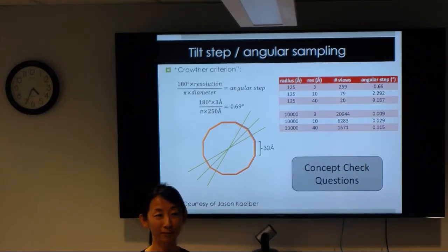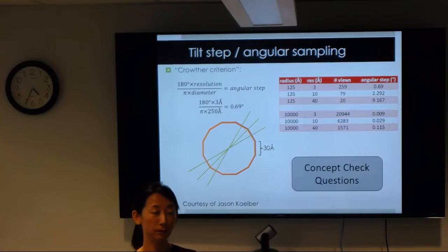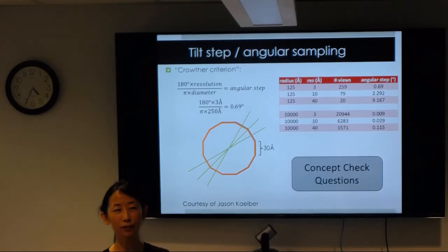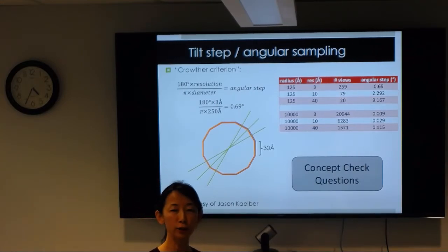Single axis has better stability and is more practical; dual axis has a lot of difficulties. You have to retarget after the rotation. If you mess it up, then you've blown it. You have only half the data dose from your sample. It used to be very difficult. For the Polara microscope, it's going to be very difficult, because they are on a very different stage.